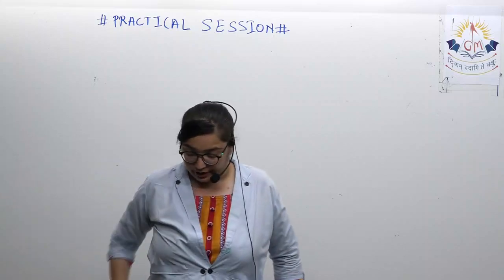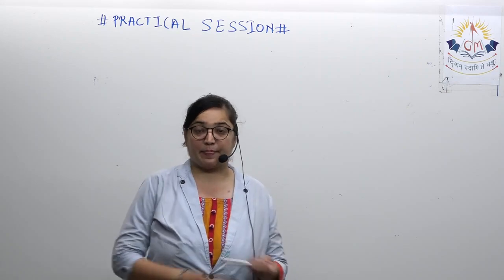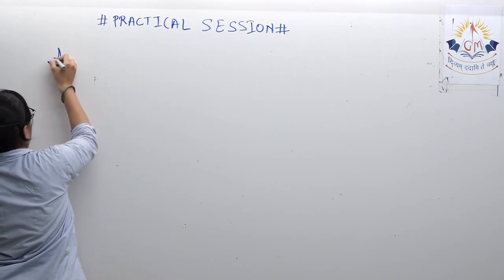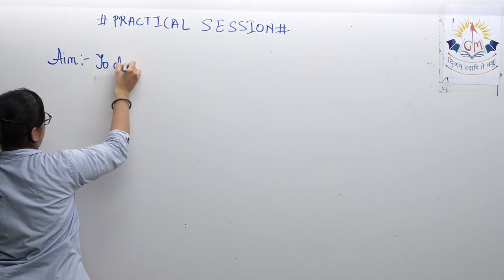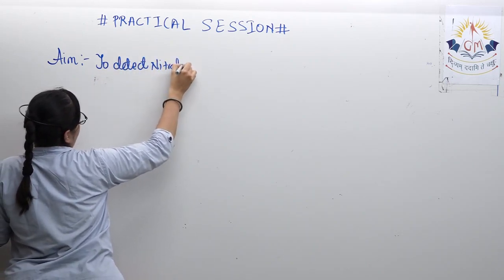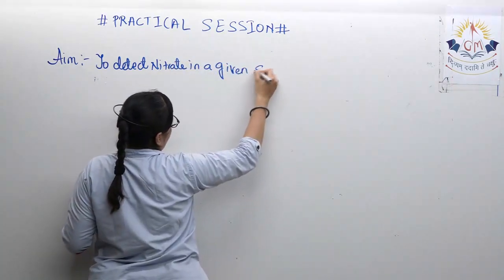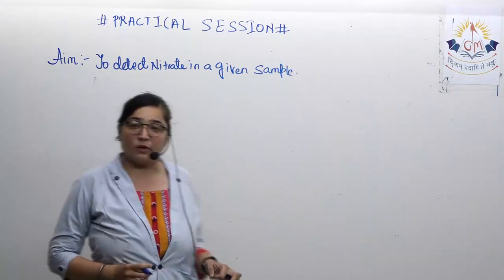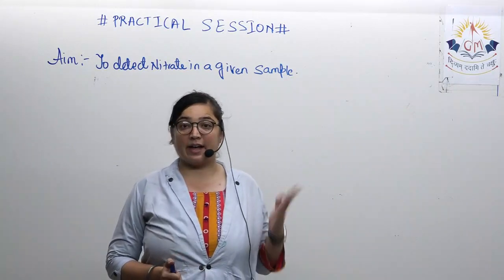What is our aim for today? Our aim is to detect the nitrate in the given sample. We will take the compound which is already containing nitrate.